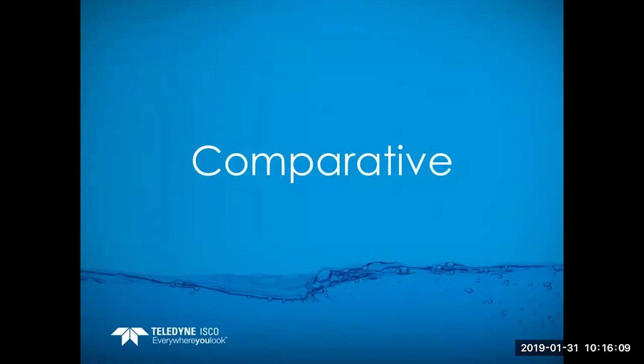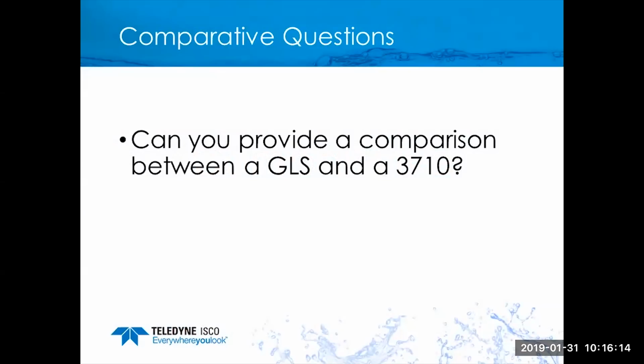Moving on to a comparative question. One of the questions we received was understanding the differences and the similarities between the models GLS and 3710. Both the GLS and 3710 samplers are composite samplers. And by that, we mean that they only use a single bottle, meaning that the samples are indeed composited in that single container. This differs from other samplers, which can have discrete samples, placing each sample in its own individual container.